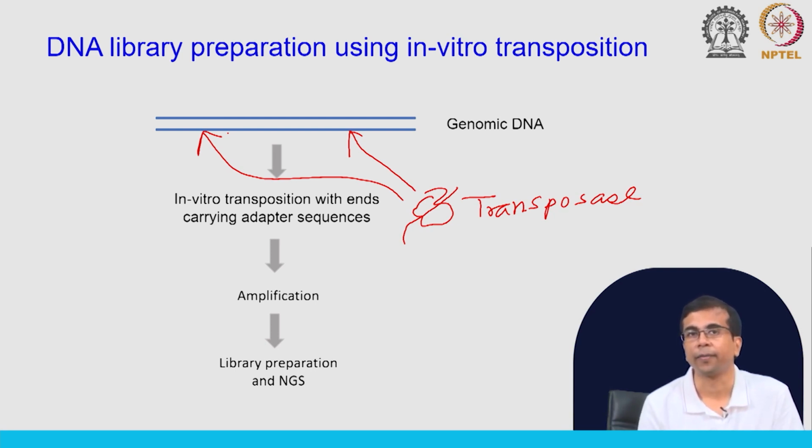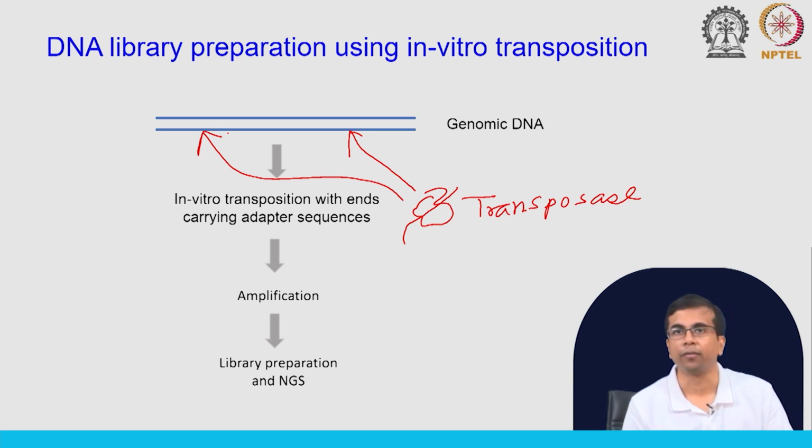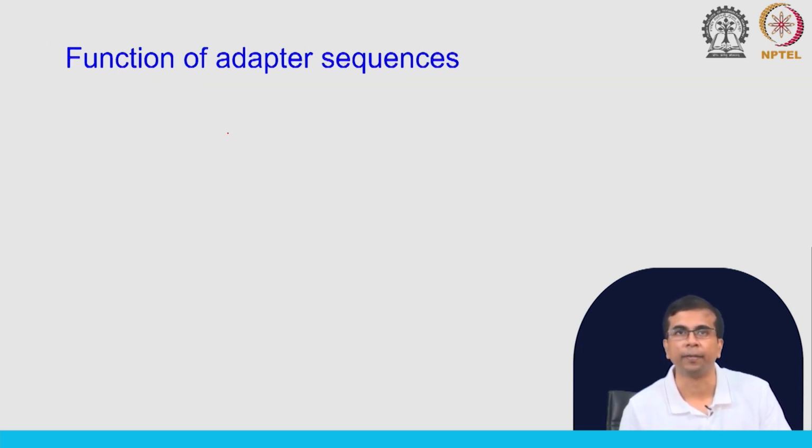go for NGS. So, you can have this library preparation step, which again could be specific to the platform. So, you can use these two methods. You can also do this transposase method. In some cases, this probably might be the only solution that you have.